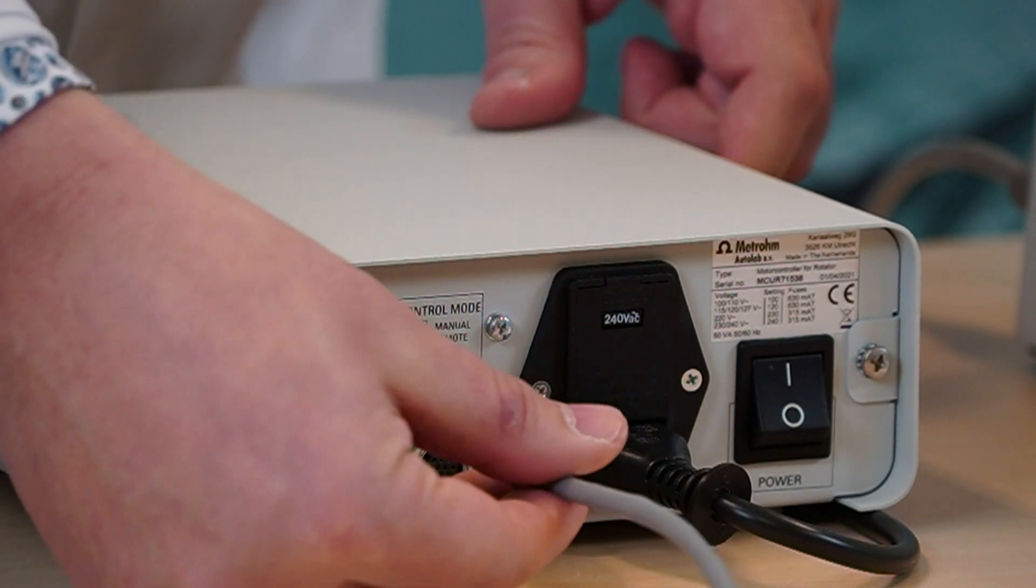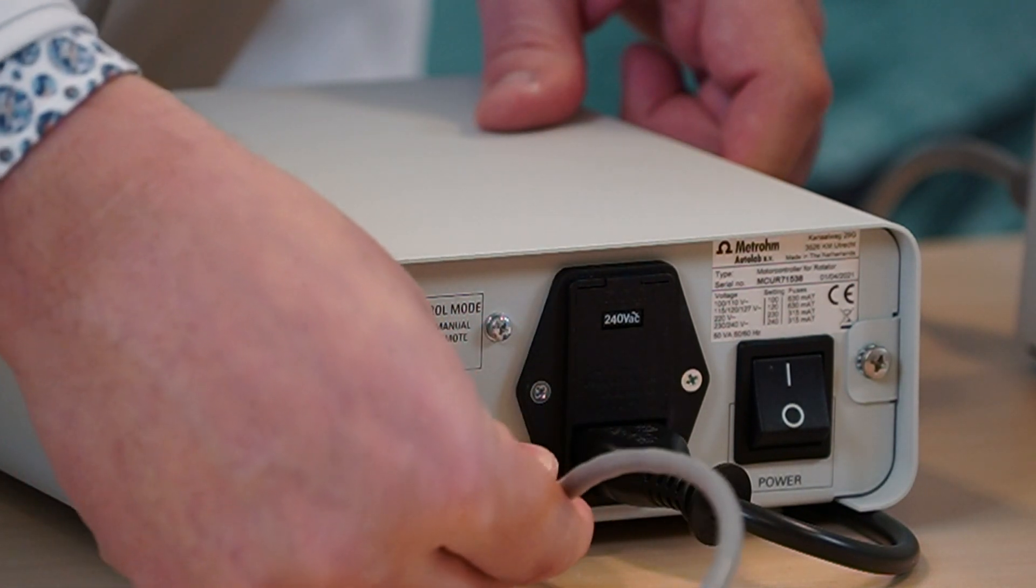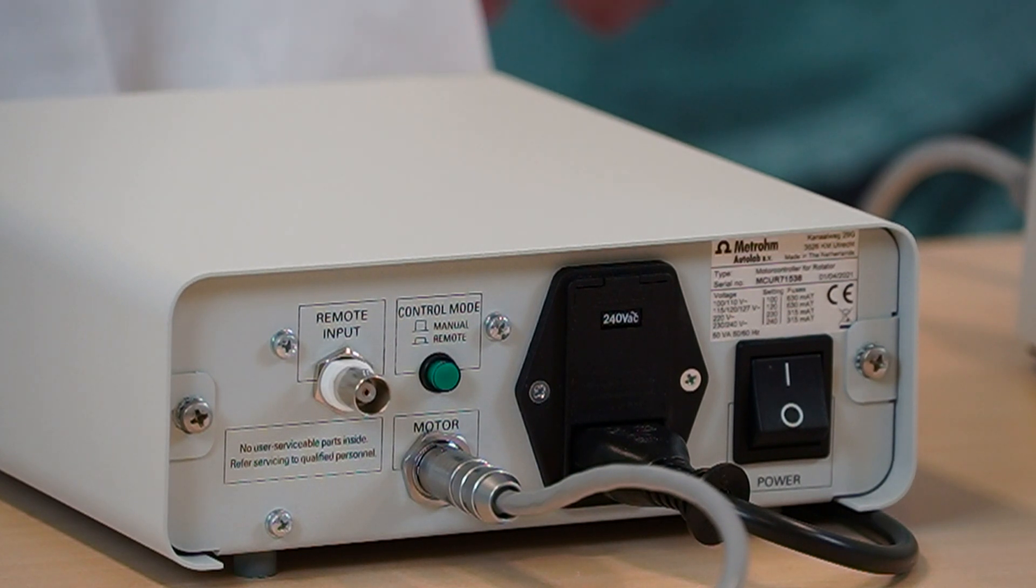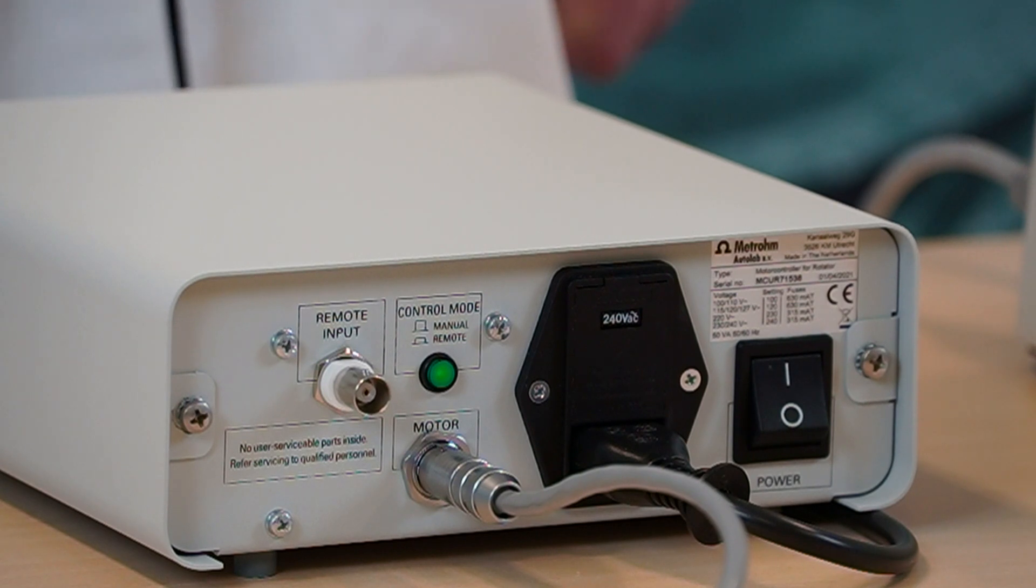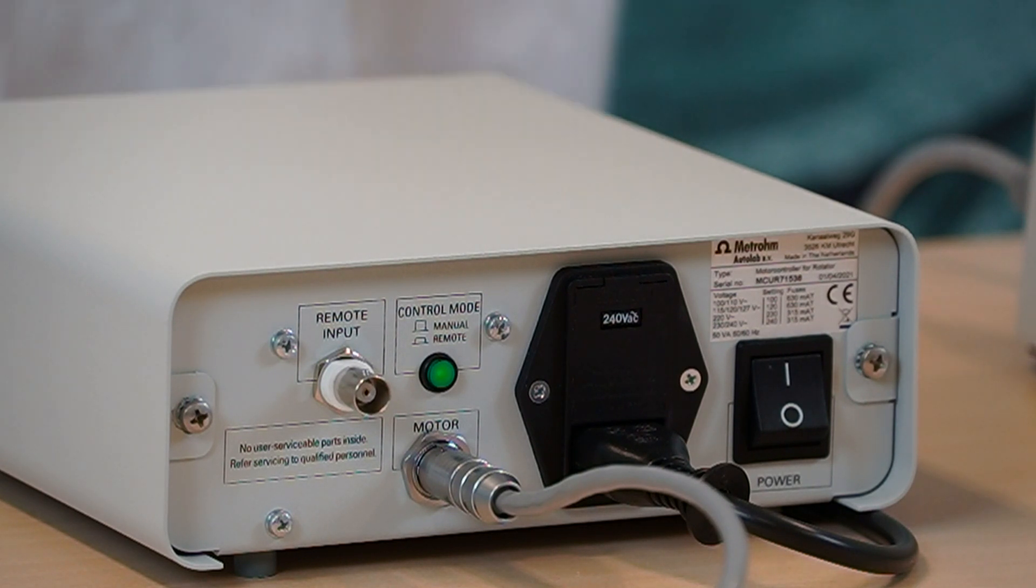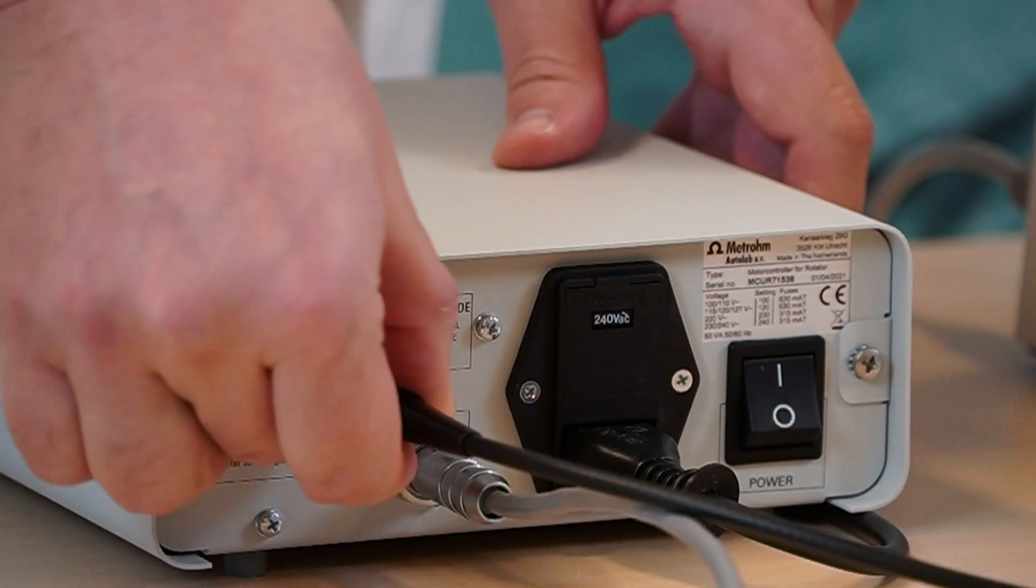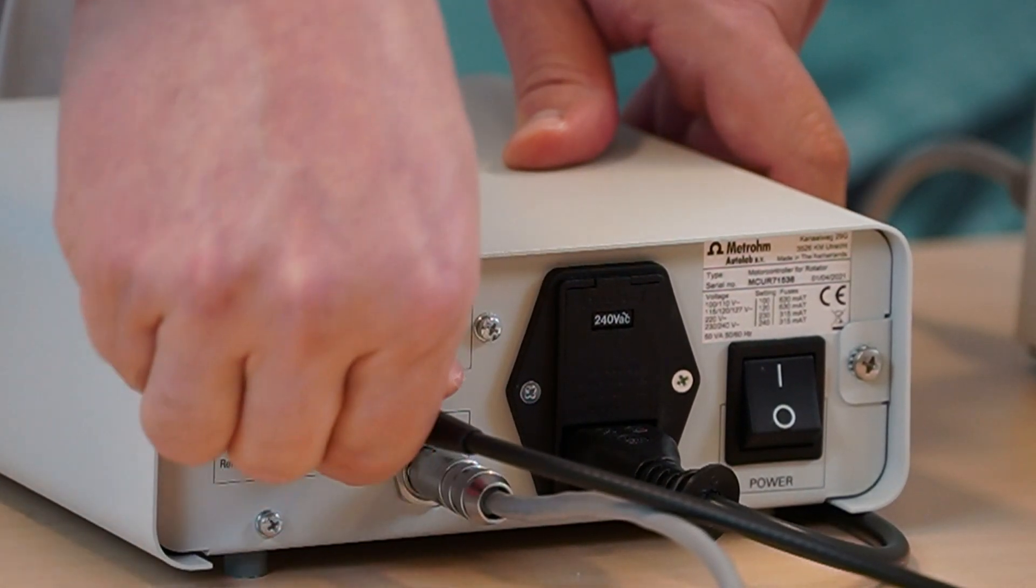Connect the rotator cable of the RDE to the motor position on the back panel of the motor controller. To control the rotation speed through the software remotely, press the control mode button on the back panel of the motor controller. Connect the BNC cable coming from the analog output, in this case the V-out of the monitor cable of the PGZ204, to the remote input on the back panel of the motor controller.